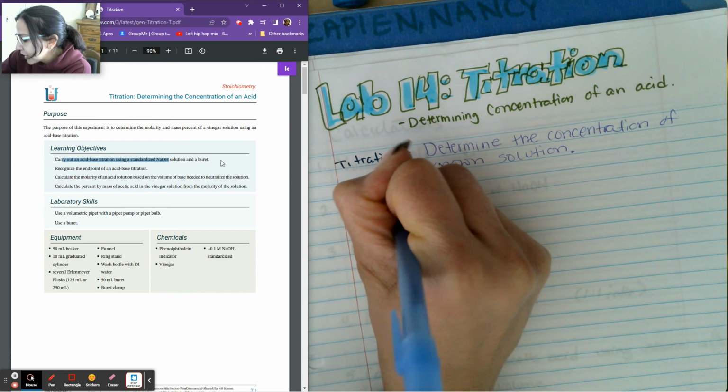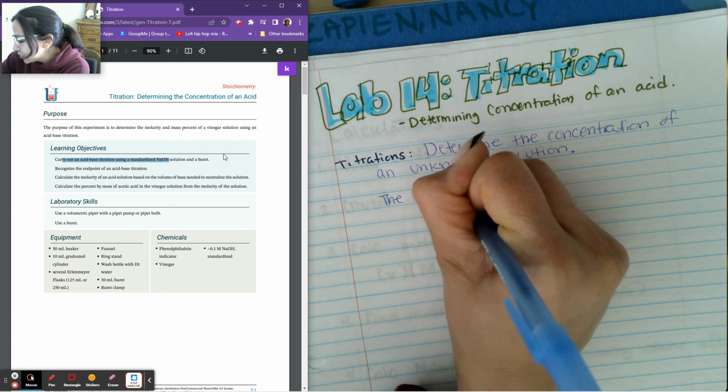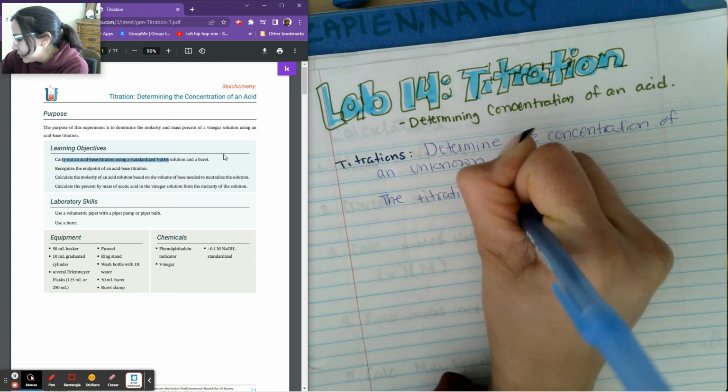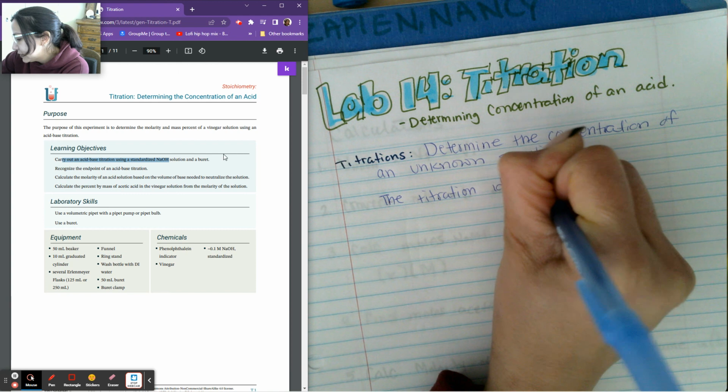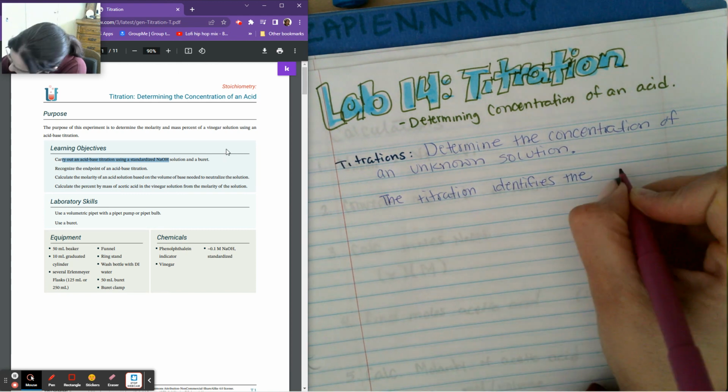So in titrations, the titration identifies the endpoint.